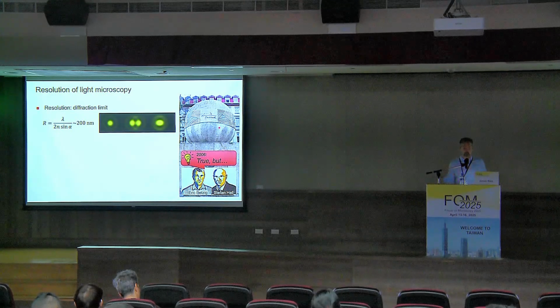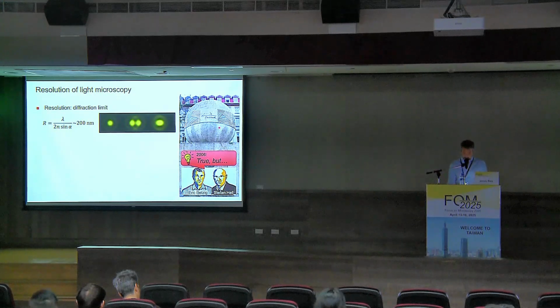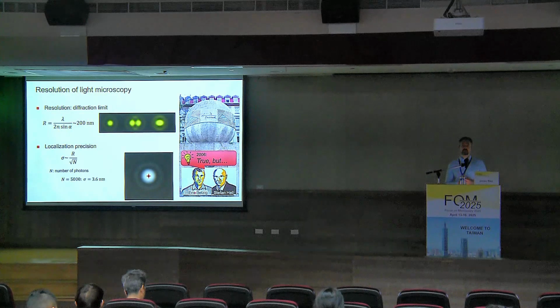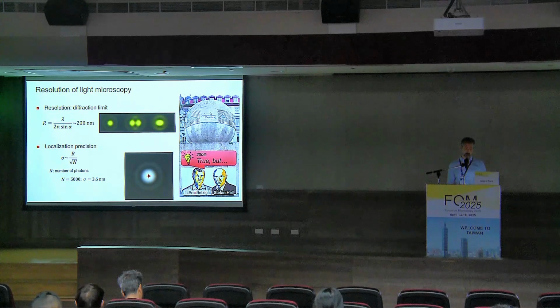Of course, they cannot ignore that light is a wave, but they found smart tricks around this limitation to increase the resolution. So today I will mainly talk about the technique developed by Eric Betzig and others that we call single molecule localization microscopy. These techniques are based on the fact that it's much easier to localize single fluorophores or small objects than to tell them apart, than to resolve them.